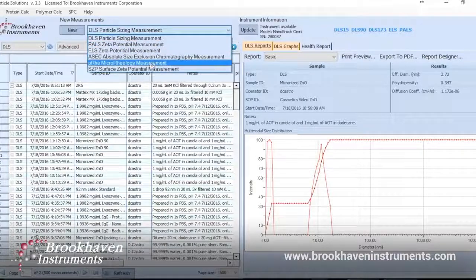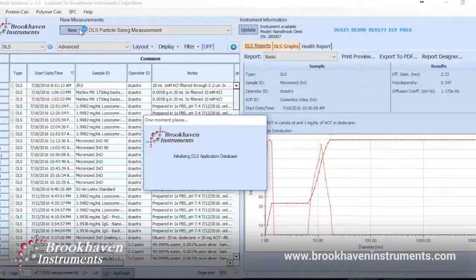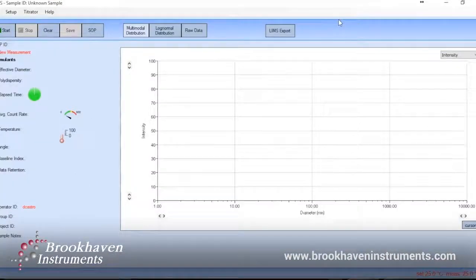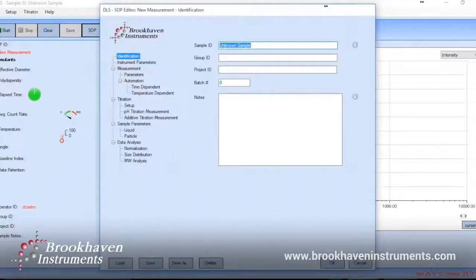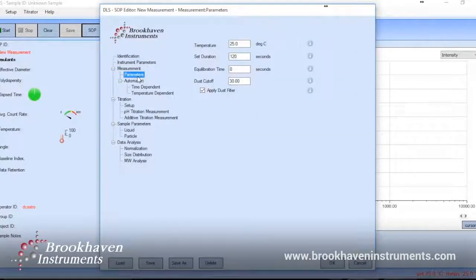First, from the drop-down menu, I will choose DLS measurement and click new. The new measurement window will open and we can begin setting the parameters for this measurement. Particle Solutions will load the most recently used standard operating procedure, but we would like to use a new one, so we will click on SOP. Here, we can name our sample and give a description of sample preparation, batch number, and any additional notes. We then go through each category and fill in parameters such as measurement time, temperature, and a dust cutoff. This dust cutoff ignores any outlier random spikes in the collected data to avoid their use in calculating an actual particle size.